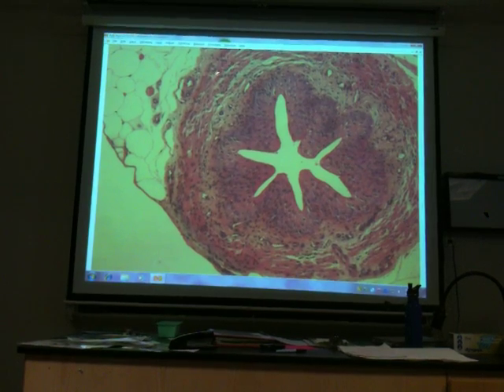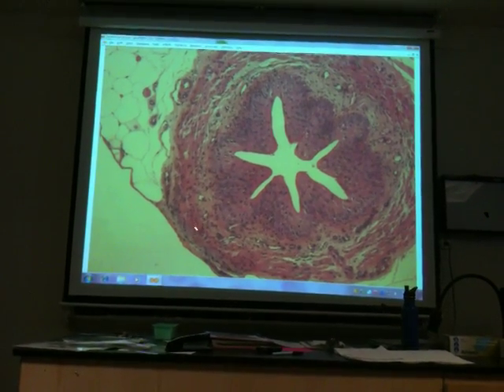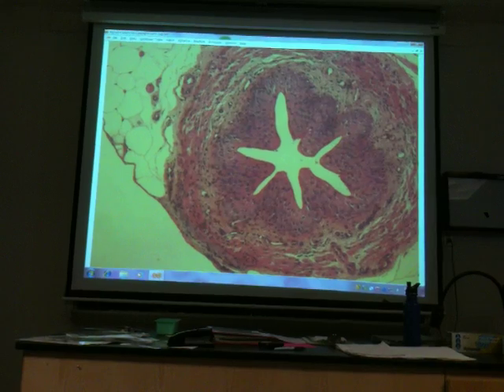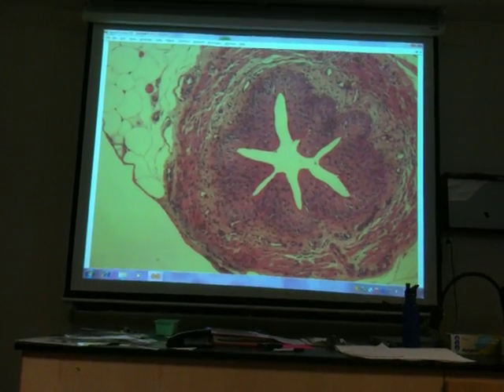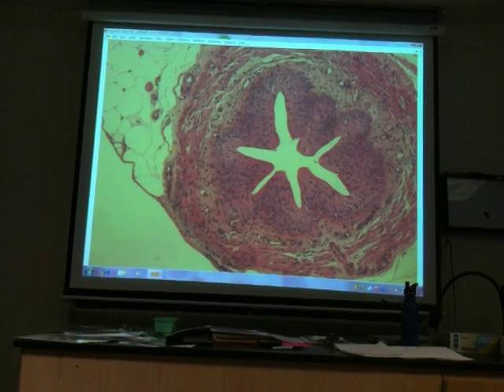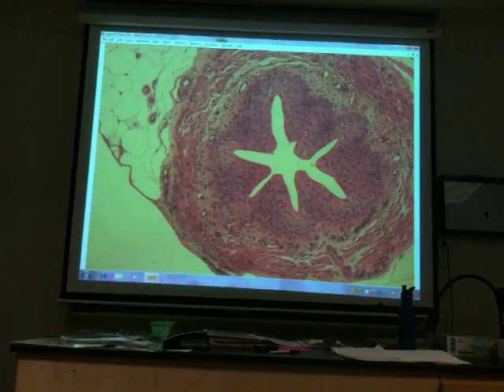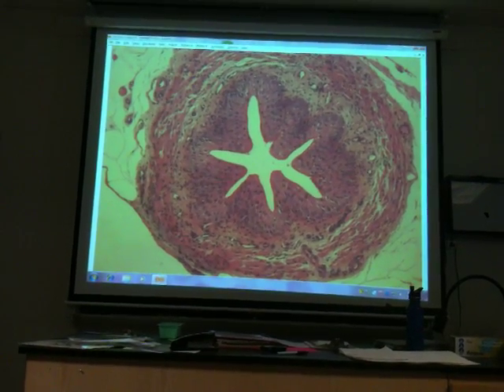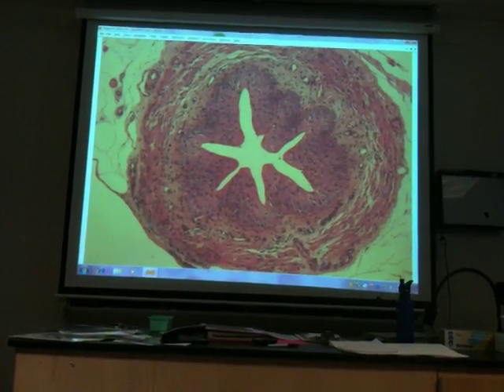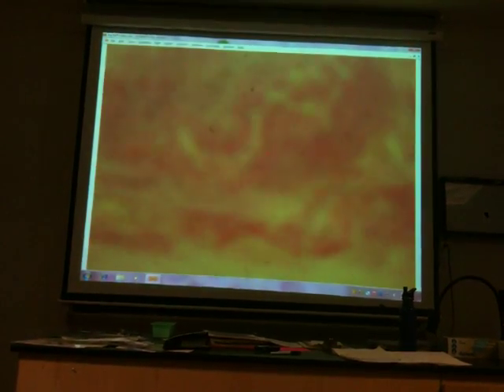And it is presented in sublayers, two sublayers. We're not necessarily recognizing them or studying them, but in order to affect peristalsis, it has to be. In this ureter, we can get the entire thing in our field of view at low power. Now let me show you the urinary bladder. It's not possible with the bladder to get a full cross-section, even of a small mammal bladder.